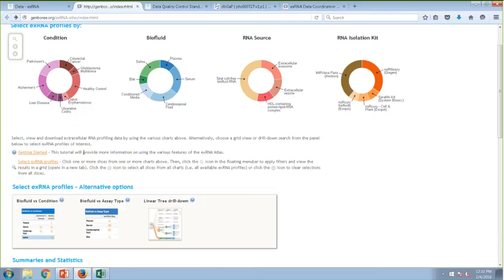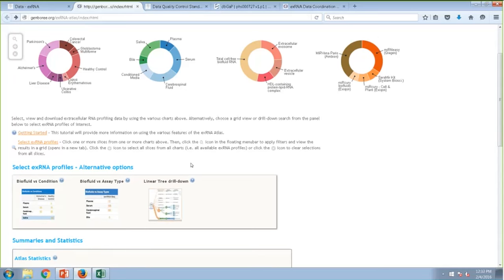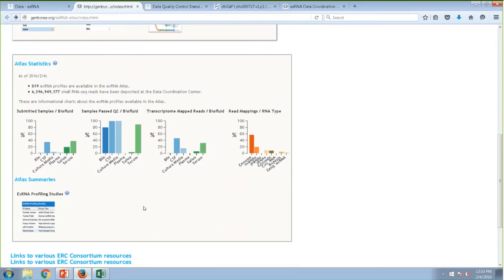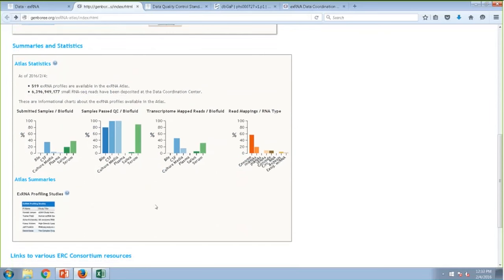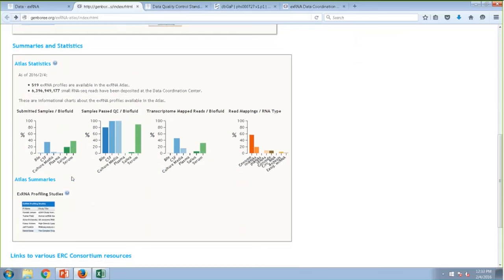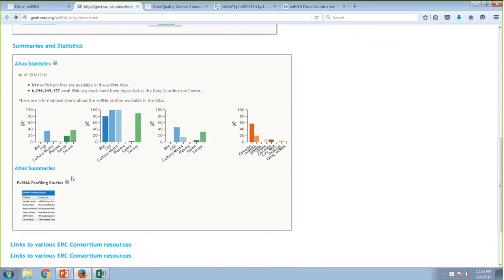Those are four different ways of exploring data in the Atlas. Now let's look at some statistics. These informational charts give you percentages — for example, out of the 519 samples, 35% are from CSF, and so on. You can look at all these different distributions.